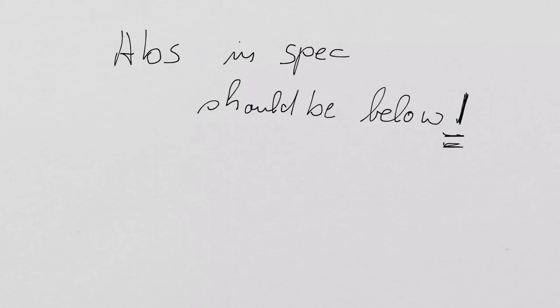That's sort of a rule. If the absorbance gets over 1, it usually means the measurement is not very accurate. So whenever you use a spectrophotometer, try to keep the absorbance below 1. How could you do that?